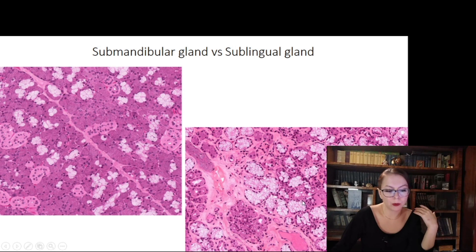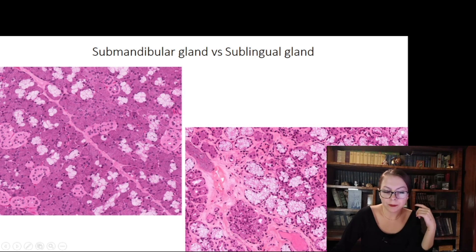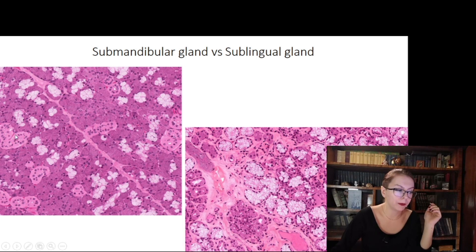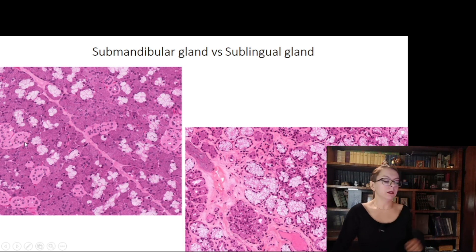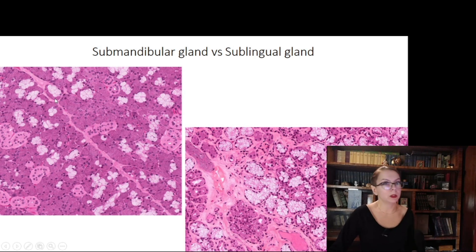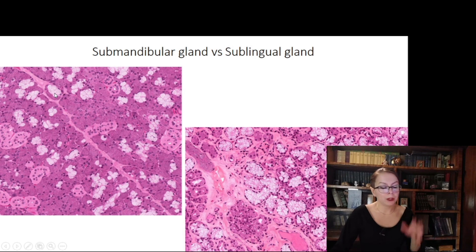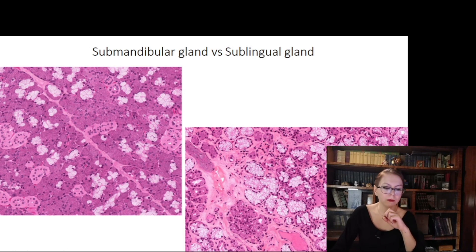In the sublingual gland, vice versa — mucous cells predominate over serous acini. If you see acini with empty cells predominating over serous acini, this is the sublingual gland. Also pay attention to the striated ducts, which are well prominent in both cases. Notice the mixed acinus: serous cells form the so-called demilunes over the centrally located mucous cells — a well-known feature.